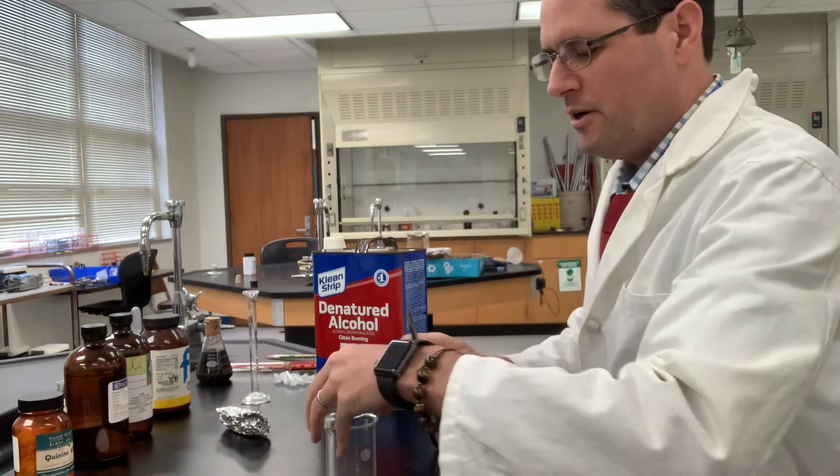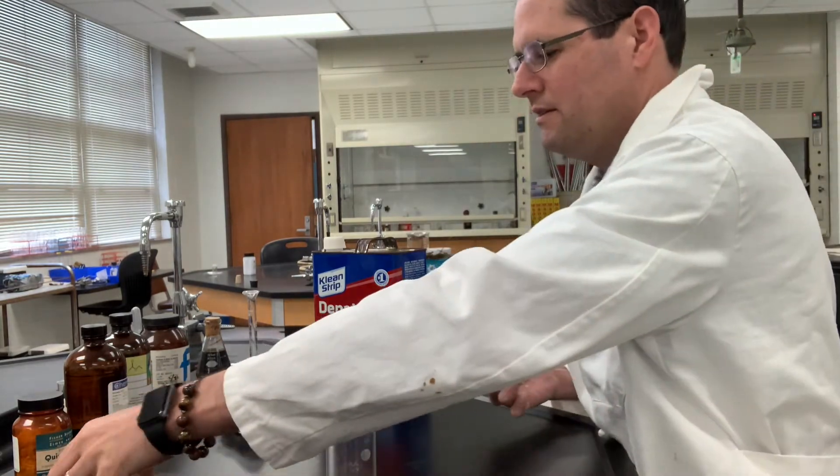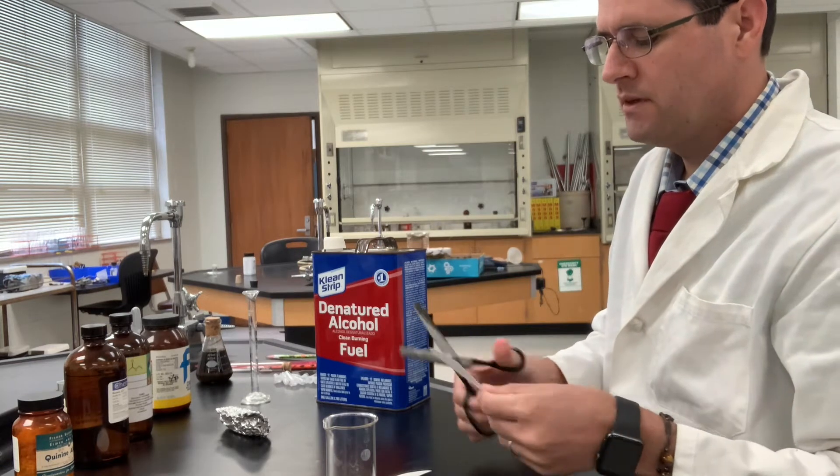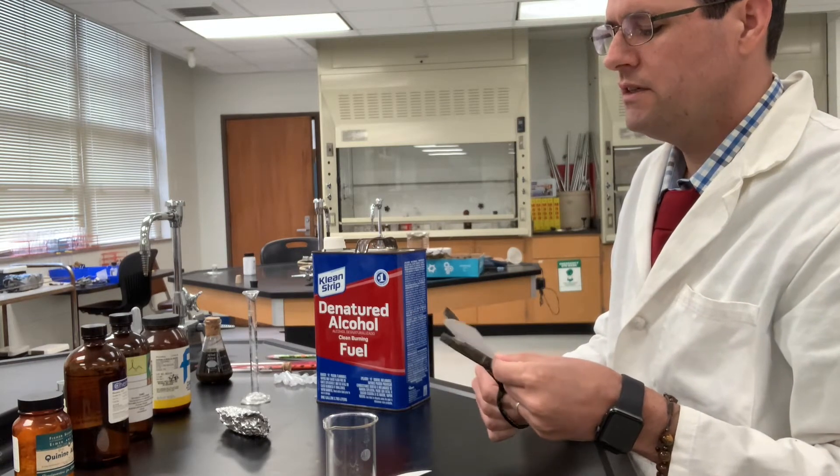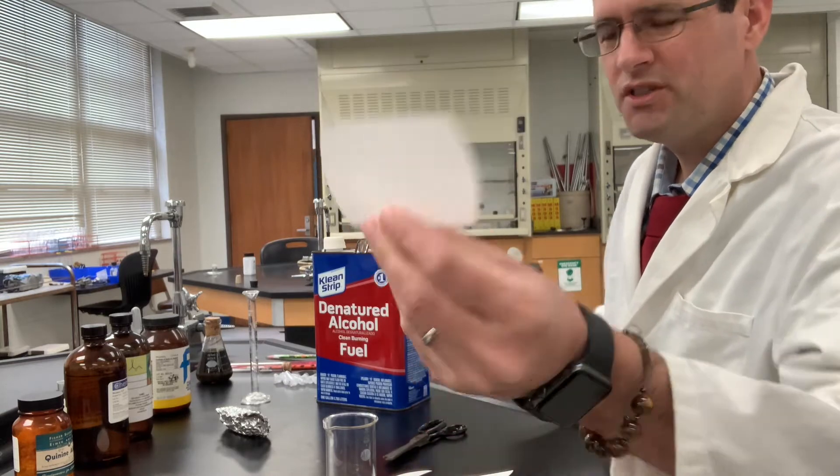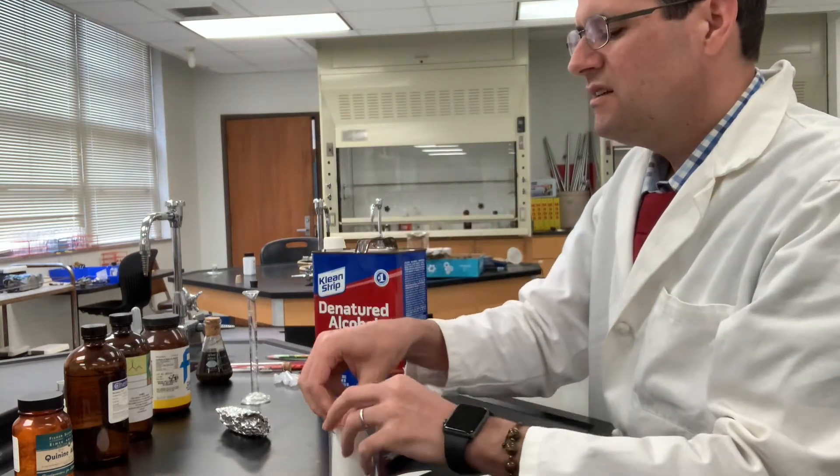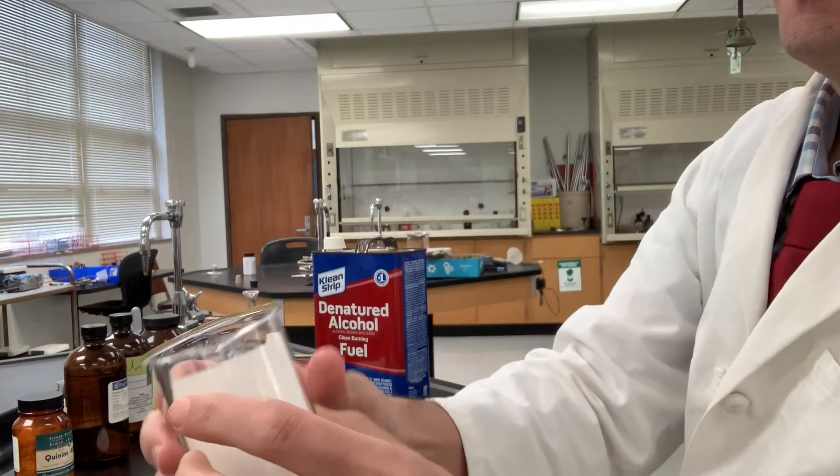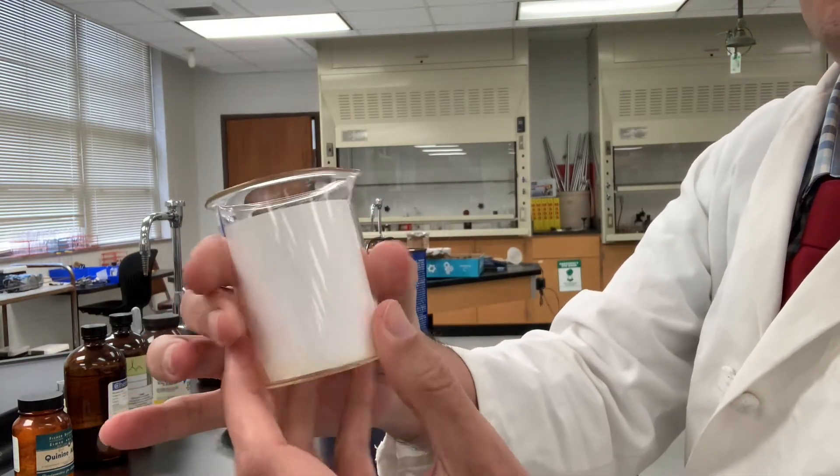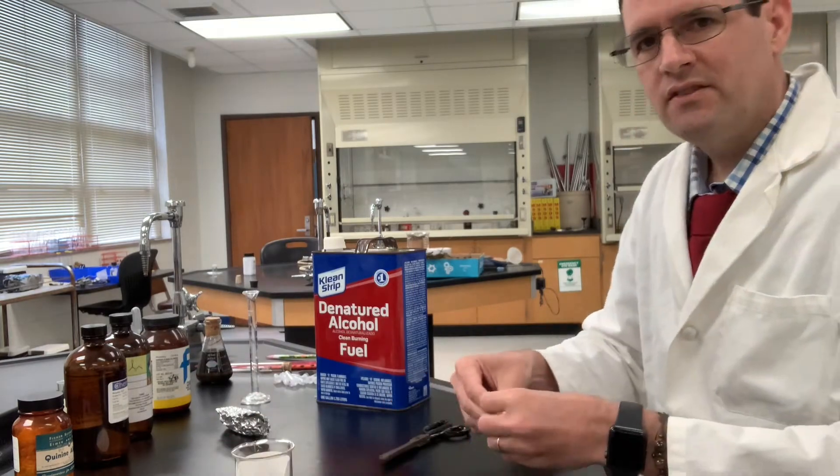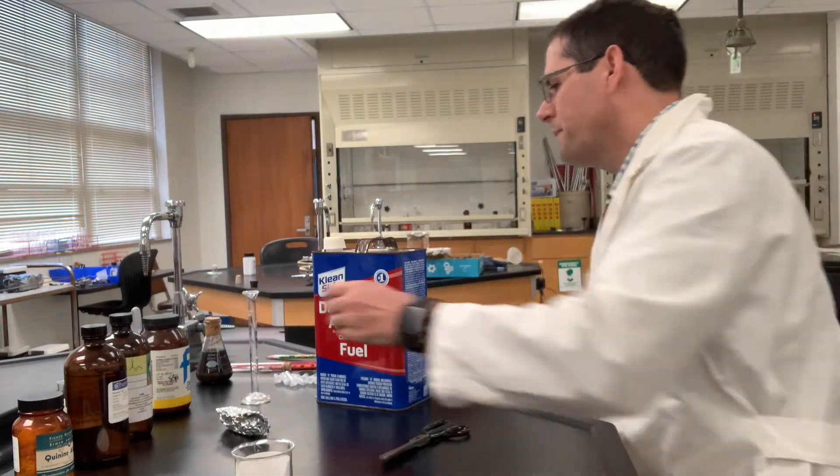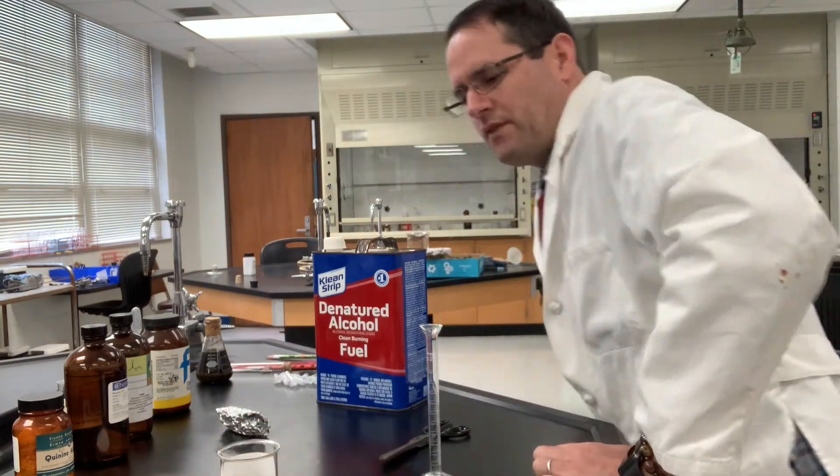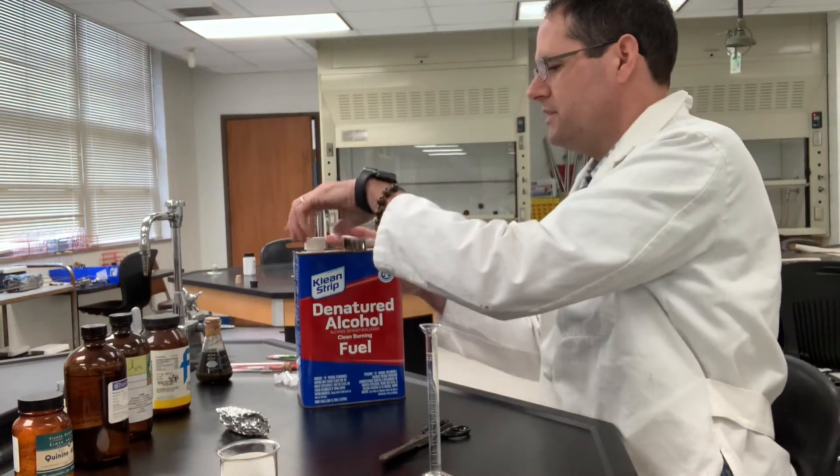First, we want to prepare our developing chamber here. Grab a piece of filter paper and snip off portions there so it makes a nice little curve around the glassware like so. The purpose of that is to saturate the air in there with vapors of the solvent so it doesn't evaporate off your TLC plate.